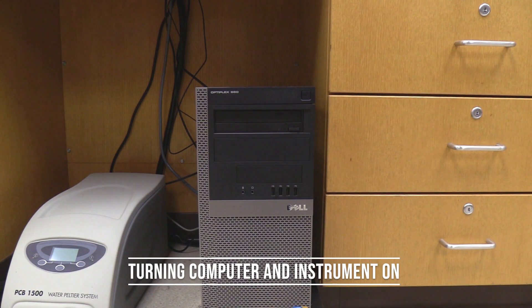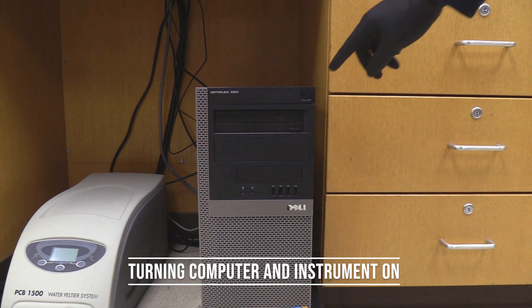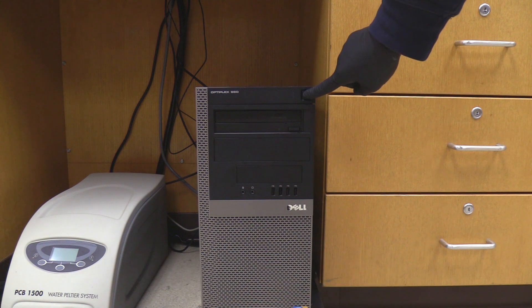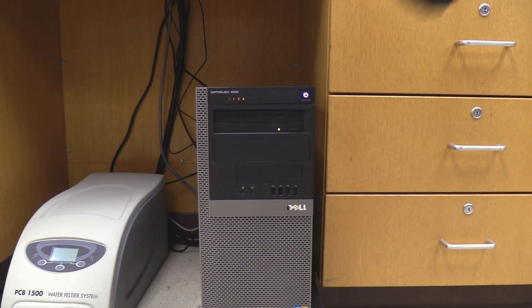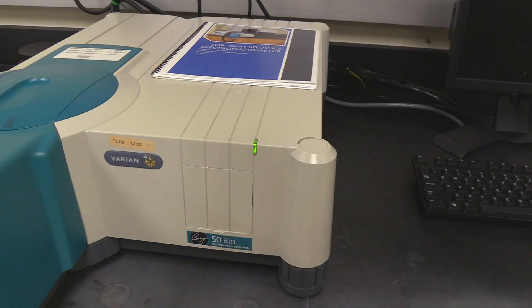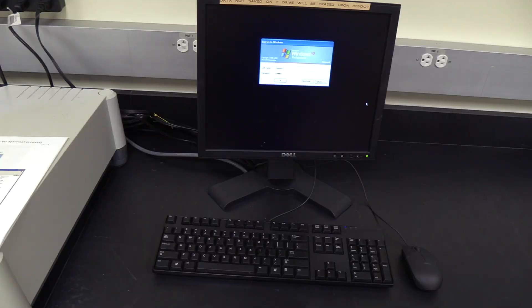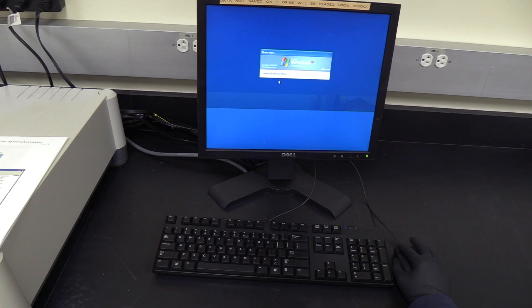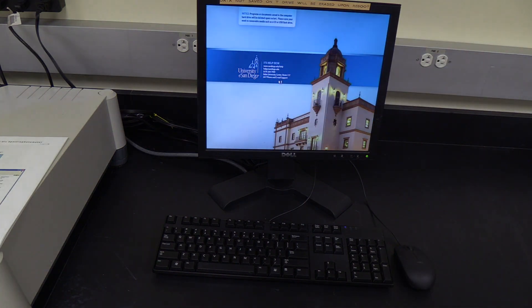Turning on the computer and instrument: press the power button on the front top right corner of the computer tower. The instrument power light should turn on. Next, log into the instrument computer. The username and password are found in the instrument SOP.